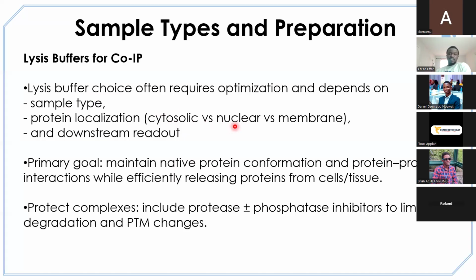If it's in the nucleus, of course, you should find a way to permeabilize the various membranes in order to get access to your proteins. So mostly read about the protein, know the location of expression, know the type of buffers that have been used. They always say that there is nothing new under the sun. Whatever you want to do, there are protocols. Optimize the protocol, make sure it works well for your experiment.